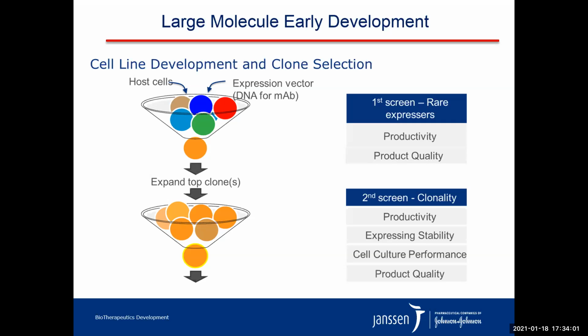situ plate seeding. These single clones are then expanded to 96 deep well plate screens, fed batch shake flask screens, and final ambr bioreactor screens to finally select the top clones. The entire process takes roughly 6 months, depending on the molecule, from transfection to selecting a manufacturing cell line. We use fit-for-purpose analytical methods, including mass spectrometric assays, for product quality analysis throughout this screening process.